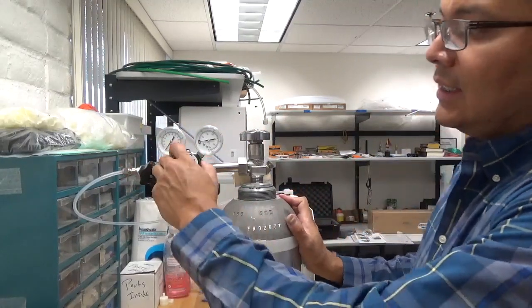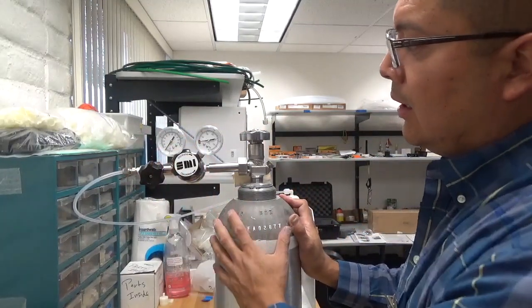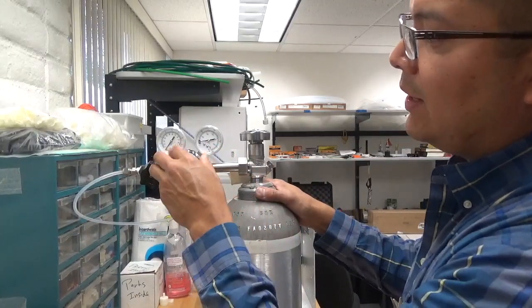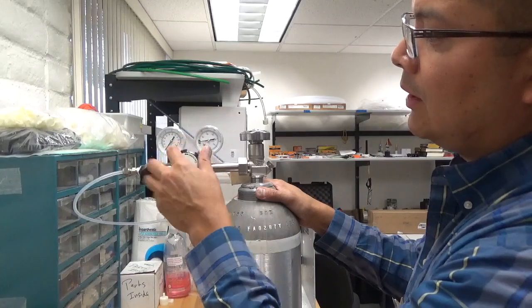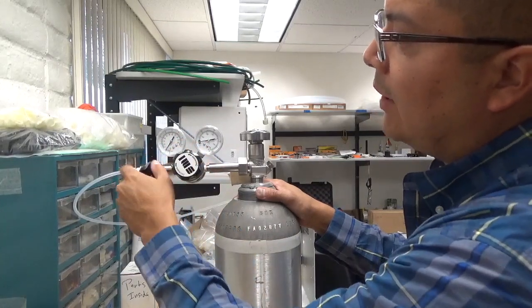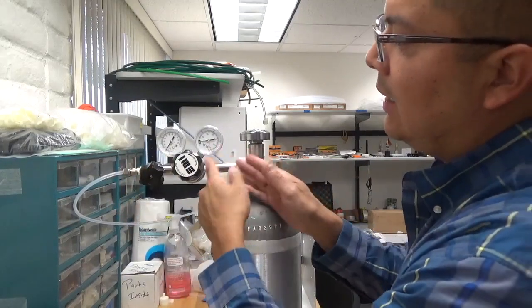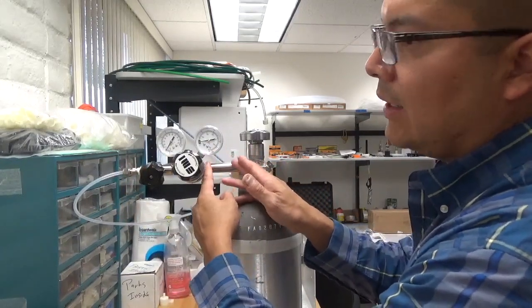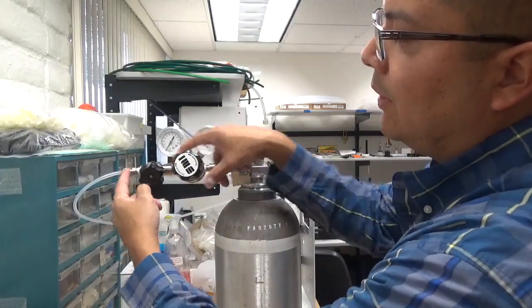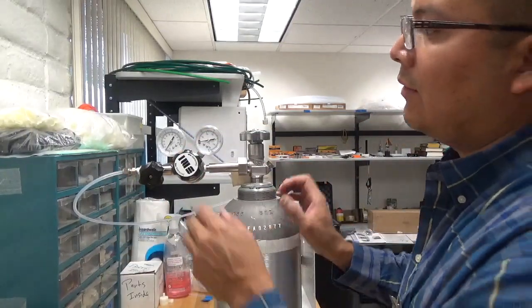As you can see, the cylinder valve pressure gauge is reading zero. What I want to do is I want to open that up and at the same time open up the output valve just to evacuate any air that might be in this portion of the regulator valve and the portion for the output section of the regulator valve.